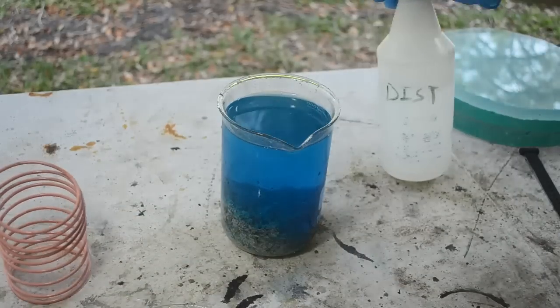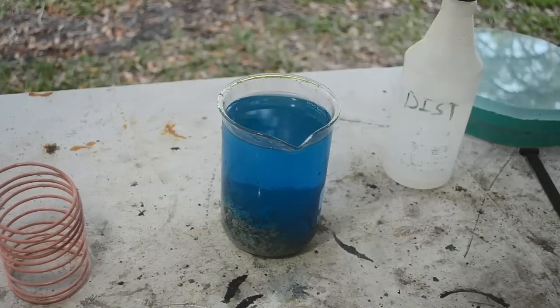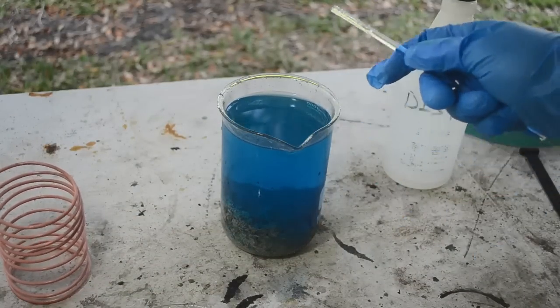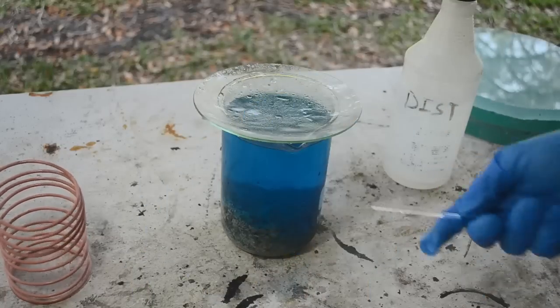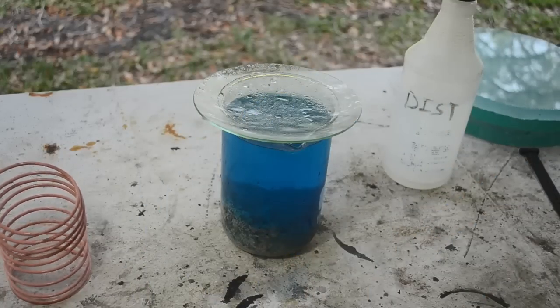Okay, so there's our silver. So I'll start by just, I'll let this settle a little bit, and then I'll decant off this blue liquid and we'll start giving it some washes.